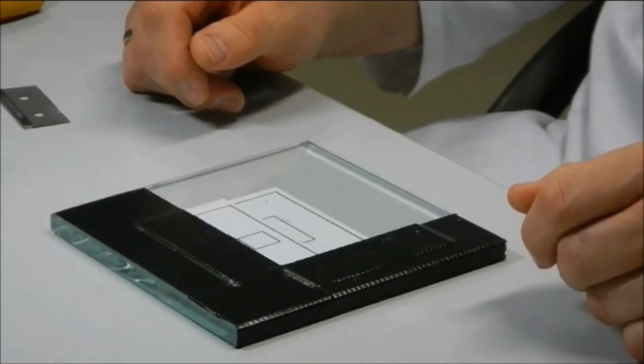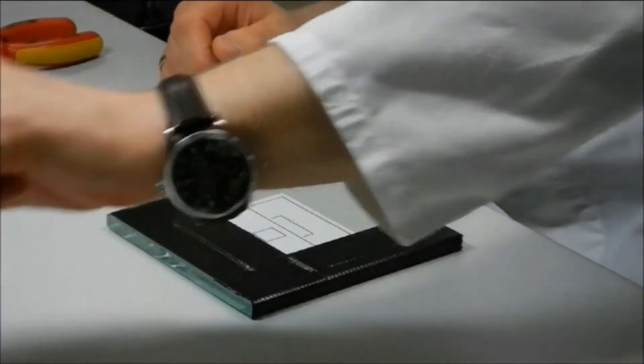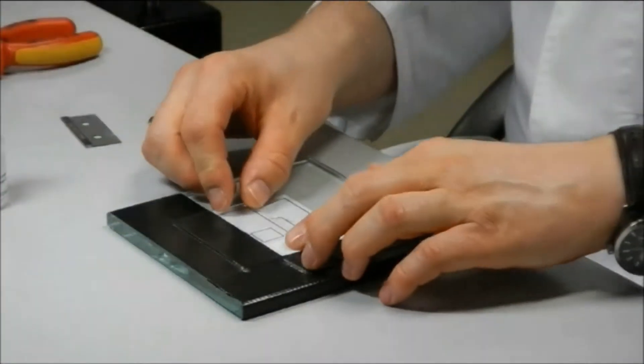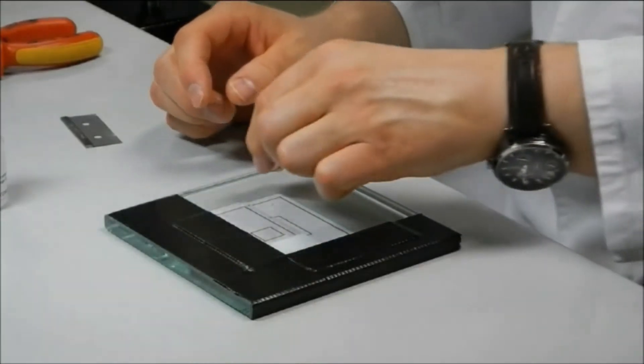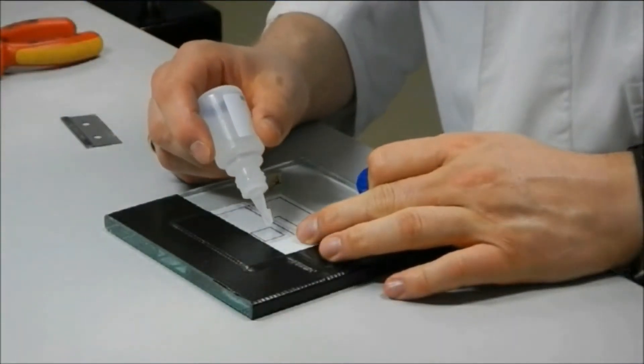To attach the sample to the glass slide, only a single drop of glue is required. The sample is then carefully positioned over the center of the slide and pressed gently down. It is now secure.